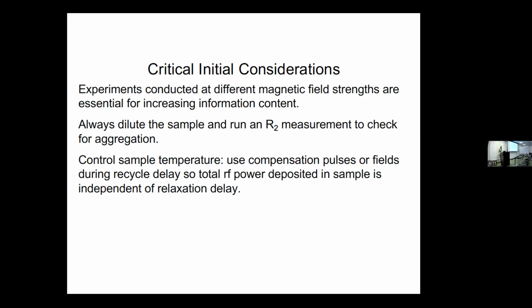And now most of the time these are set up in some interleaved fashion to average over the entire decay curve whatever temperature effects there are, rather than collecting all the data for one data point, then the next data point, then the next one. Say, collect all the given value of T1 over all the different T values, and then increment T1 and do that again, and then unshuffle the data to make the 2D experiments.